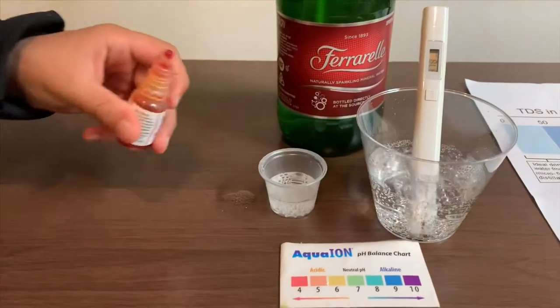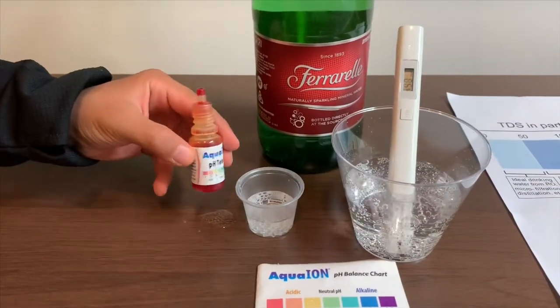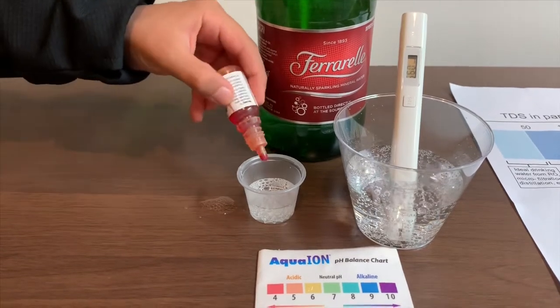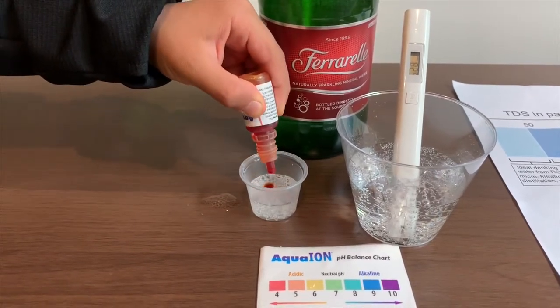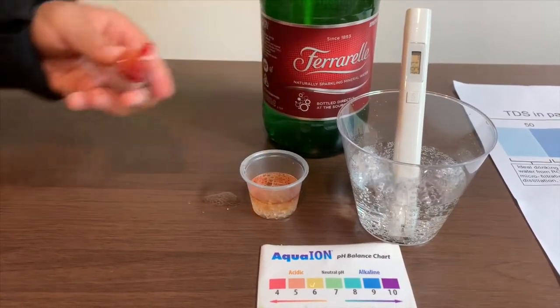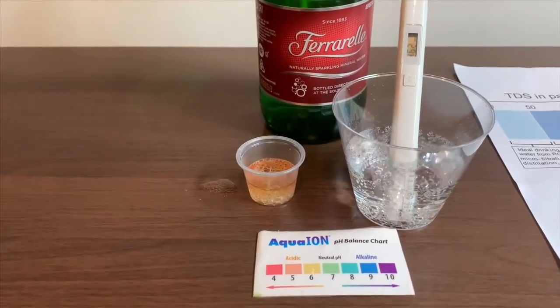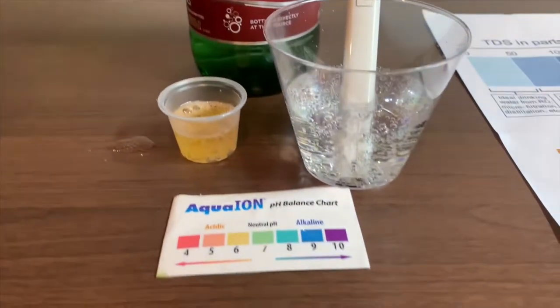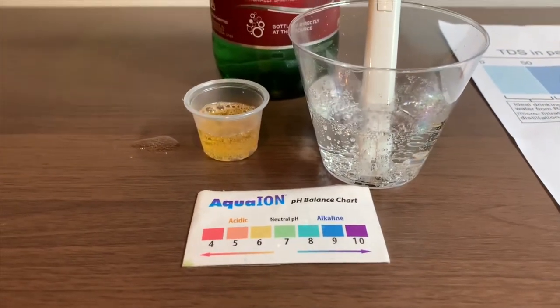Now let's test the pH level. If you want to buy this pH tester, check the link down below. Only do two drops. Press three to low for a better result. Six — that is acidic.